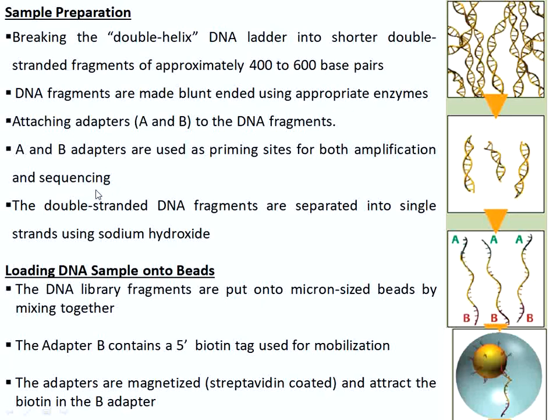Once we have attached the adapters to the DNA fragments, the fragments are made single-stranded using a denaturation treatment, either heat or sodium hydroxide.